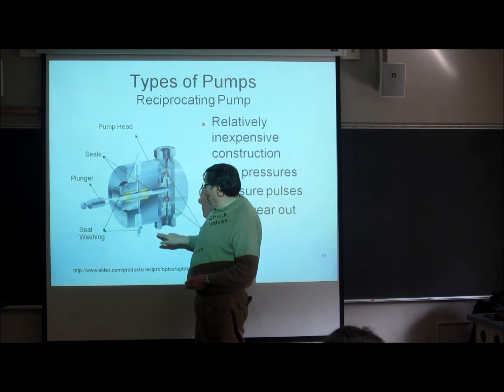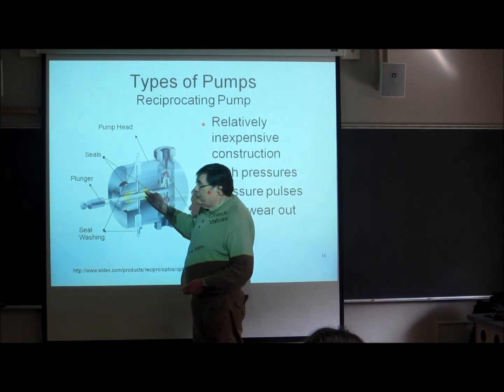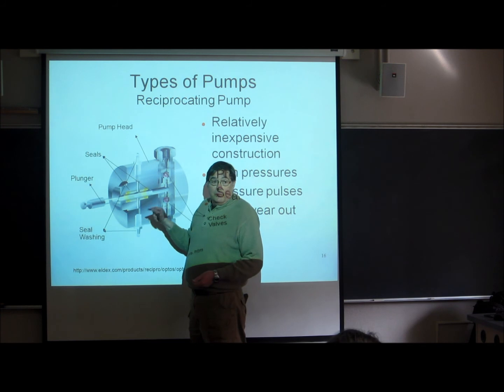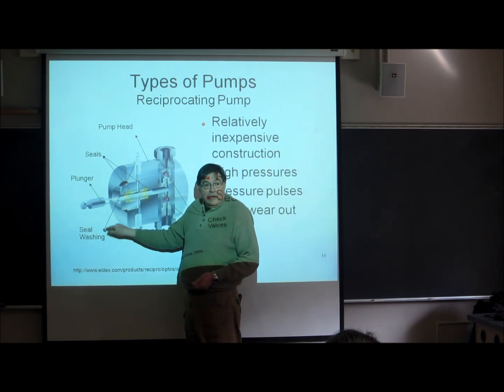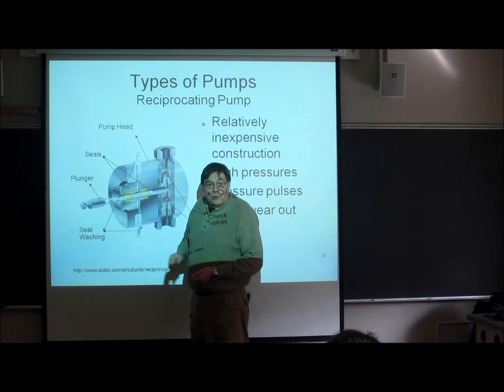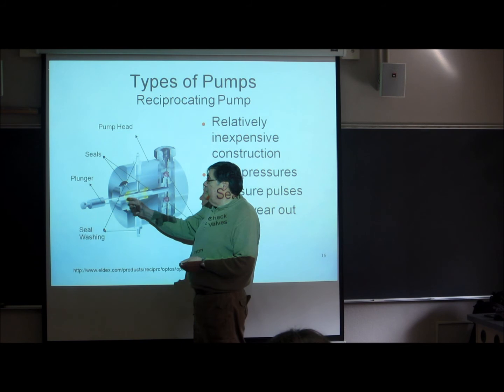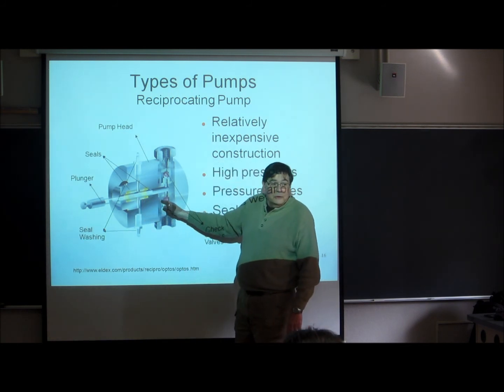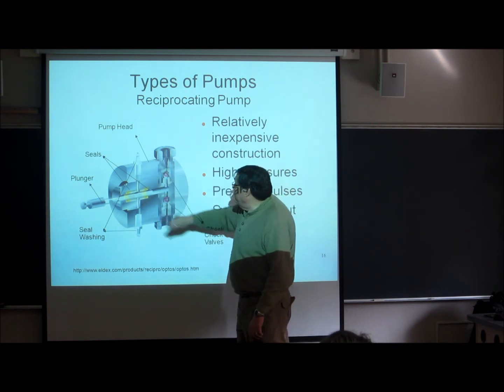Now, if you have some particles coming in with the liquid, and those particles get around this piston, unless this is an extremely hard material here, it's going to abrade the piston and cause some channels for leaking, and you're going to get leaking of solvent out here. It won't cooperate at higher pressures. Okay. Another material commonly used now is silicon carbide, another incredibly hard material.